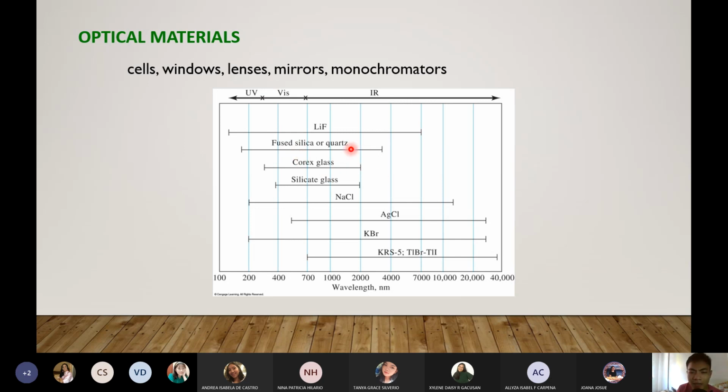In which ito ay napakamahal, sobra. So later on papakita ko yung cuvette, no. That is a quartz glass we use, no, sa UV-Vis Spectrophotometer. Okay. And actually it costs lots of thousands of peso, no. Anong nangyari kasi sa amin, before kami graduate, may nakabasag sa batch namin ng quartz glass, no. So I think that's 5 digits ata, no? I'm not really sure kung ano yung specific na amount nun.